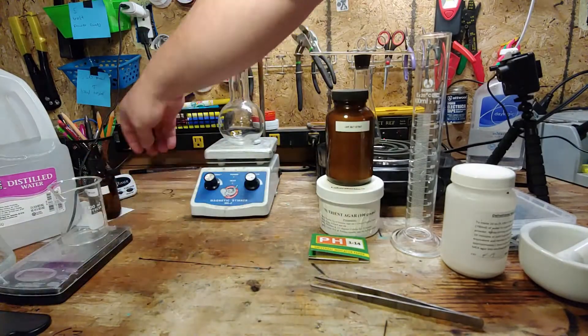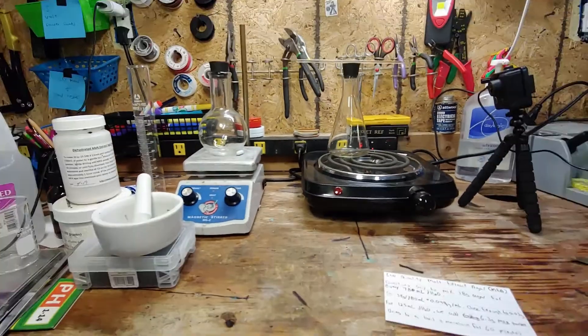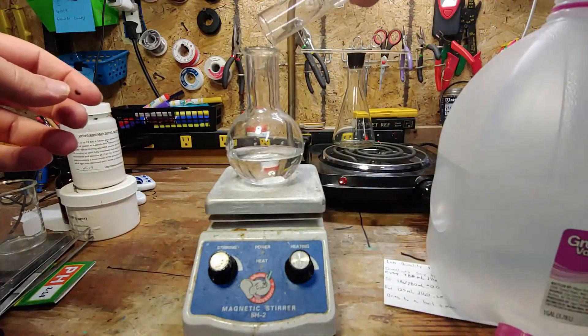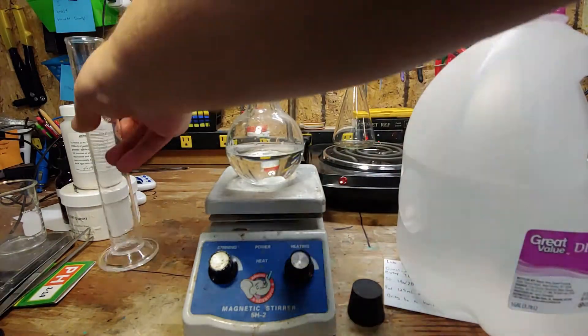First, clear an area to work. Measure out 125 milliliters of distilled water using your graduated cylinder and pour this into our boiling flask atop the stirrer hot plate. Don't forget to add the stir bar.